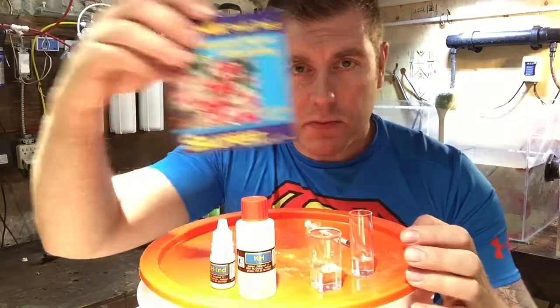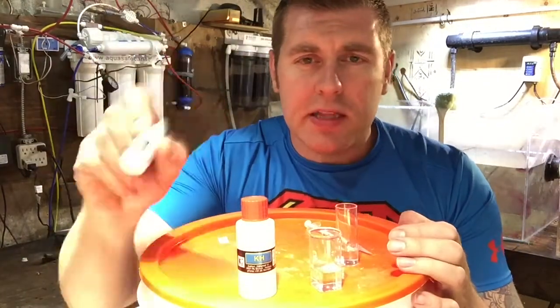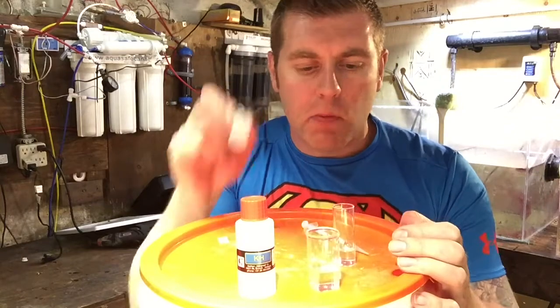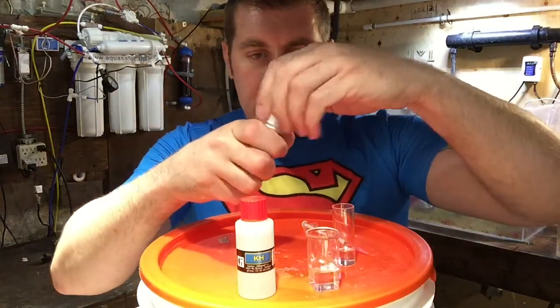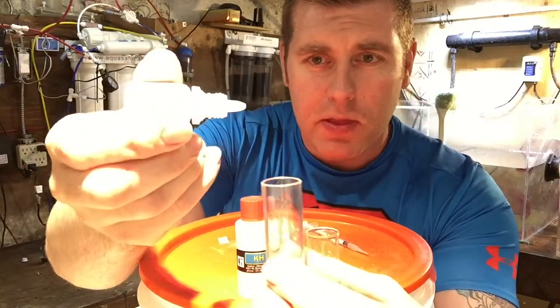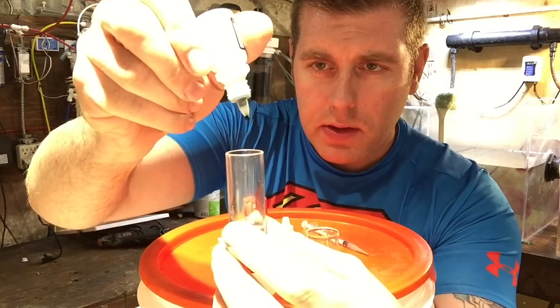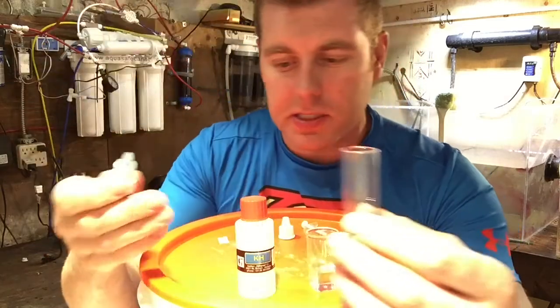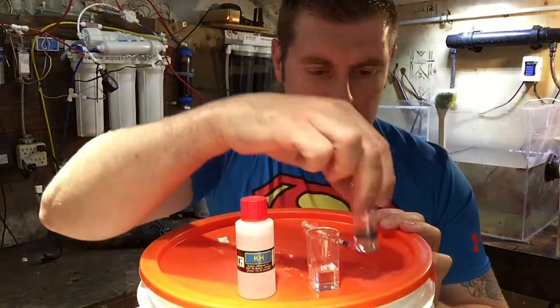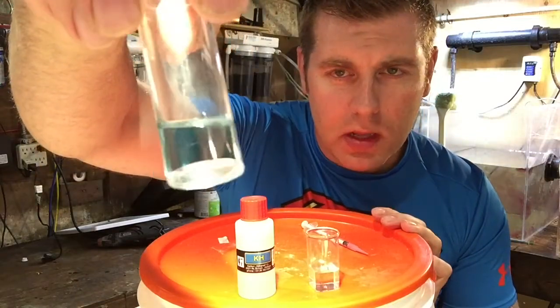Next, take the KH-Ind solution. Shake it for about four seconds and tap it on the table to make sure the solution is well mixed. Then drop four drops into the vial — one, two, three, four. Cap it so you don't spill it, then shake it a little bit. You can see it turns a bluish-green color — that's how you start it off.